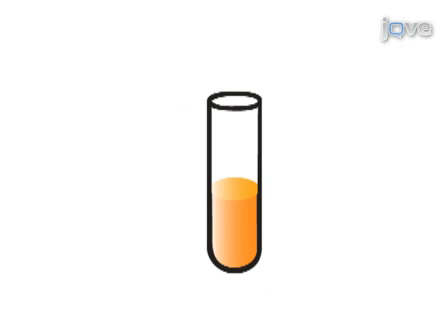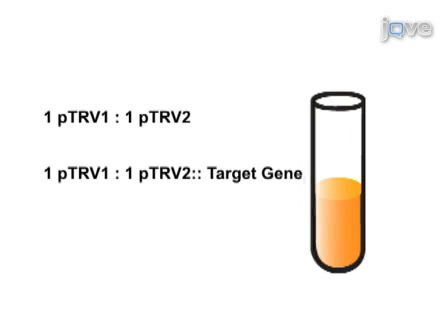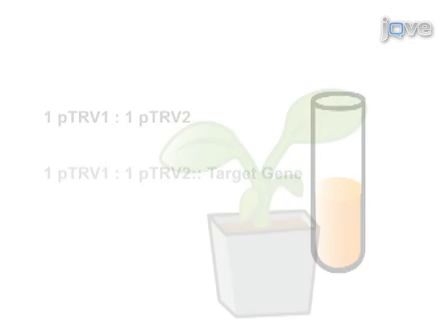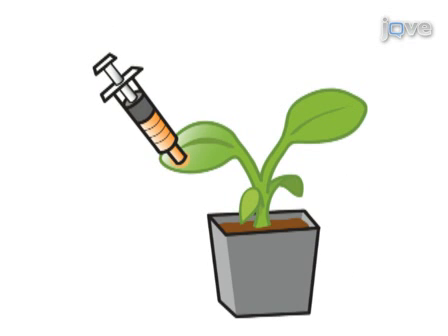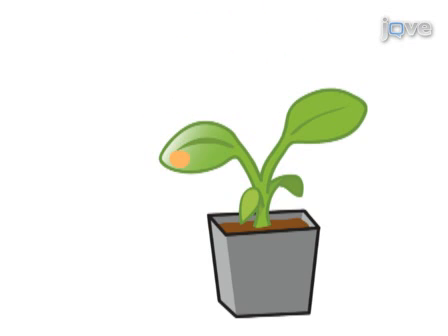The next day, a bacterial suspension of each culture is prepared, and both PTRV1 and PTRV2, or PTRV2 target gene, are mixed in a one-to-one ratio. The bacterial mixture is then infiltrated into N. benthamiana or tomato seedlings using a needleless syringe.